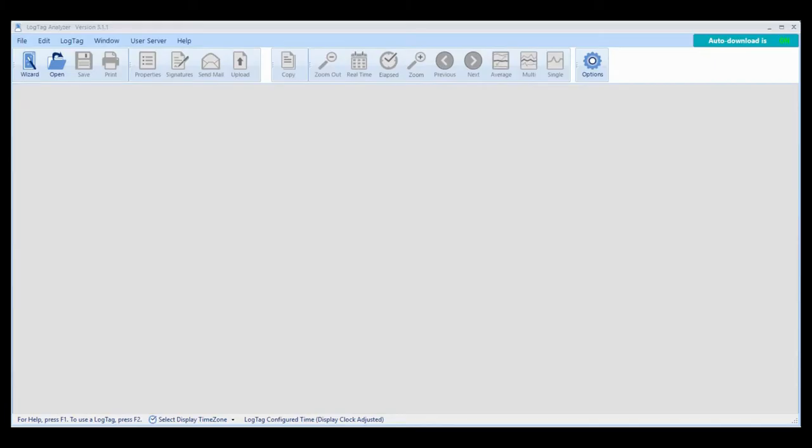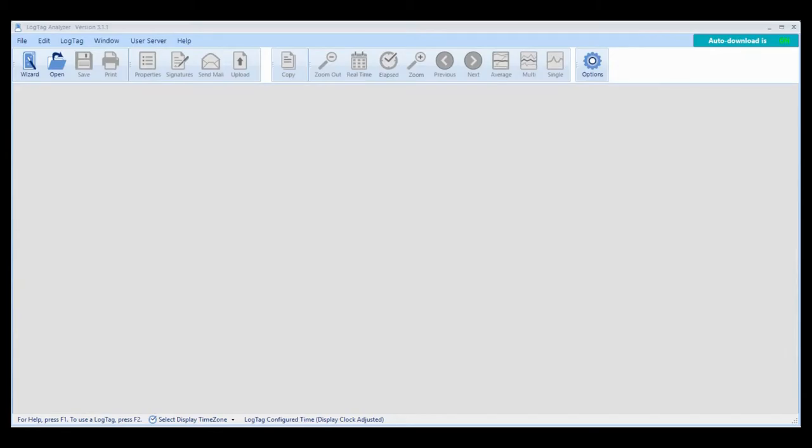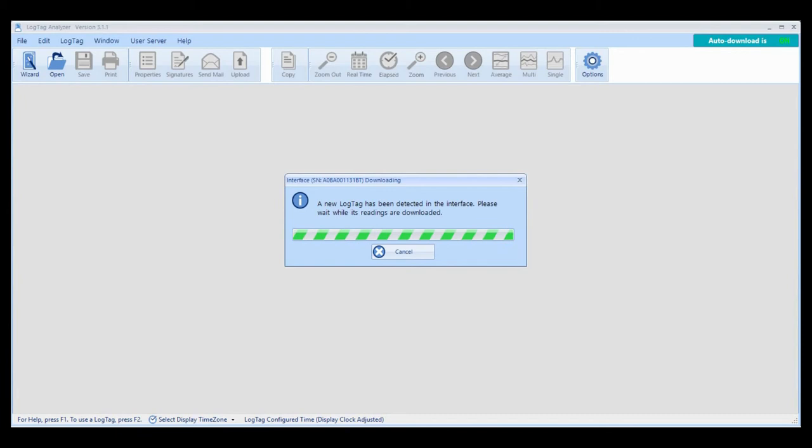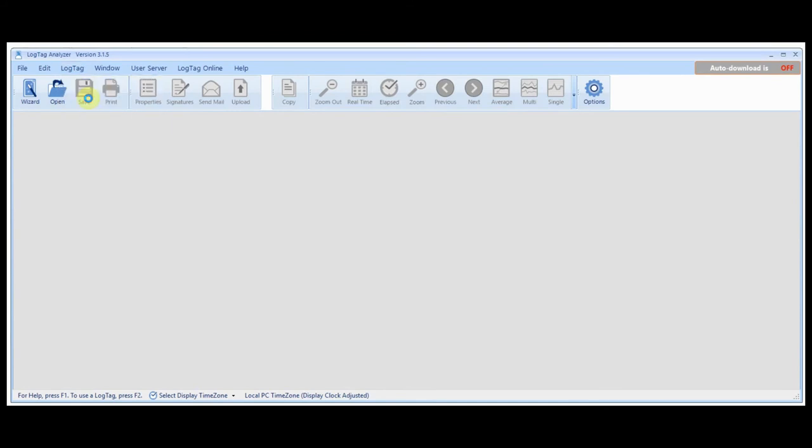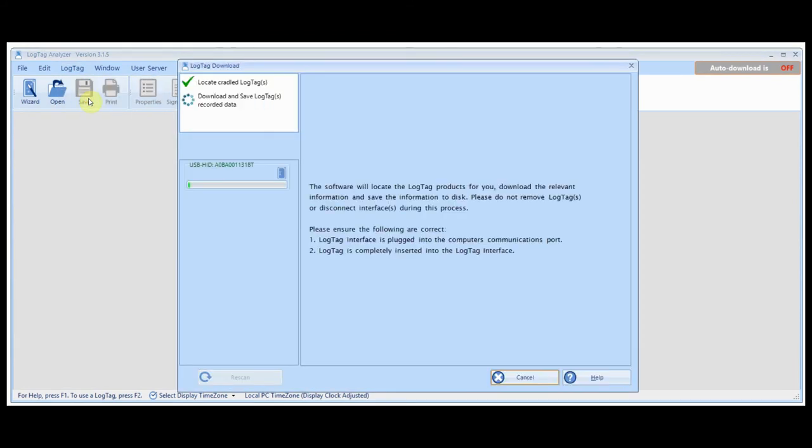To download and view your results, open LogTag Analyzer, then connect your interface cradle to your computer and place the logger into the cradle. If auto download is enabled, LogTag Analyzer will automatically display a chart of your readings. If not, click LogTag from the main menu, then click Download.